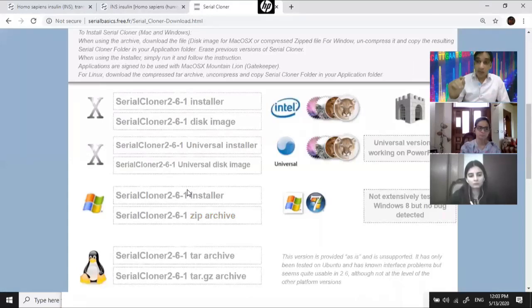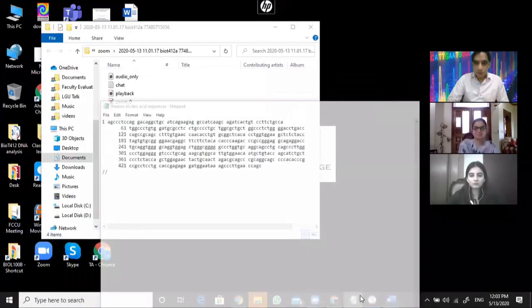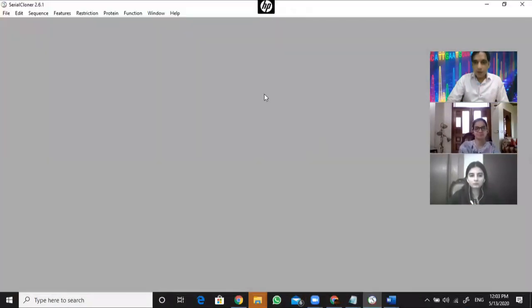This is not one of the best. This is the free best. I remember I used to have a $5,000 software in South Korea. They're rich people, a single user license for the use of one person at a time. But this is free, so everybody can use it. Of course, it does not give you the best of the best, but free is free. So when I install that software, I already installed it, already have it.